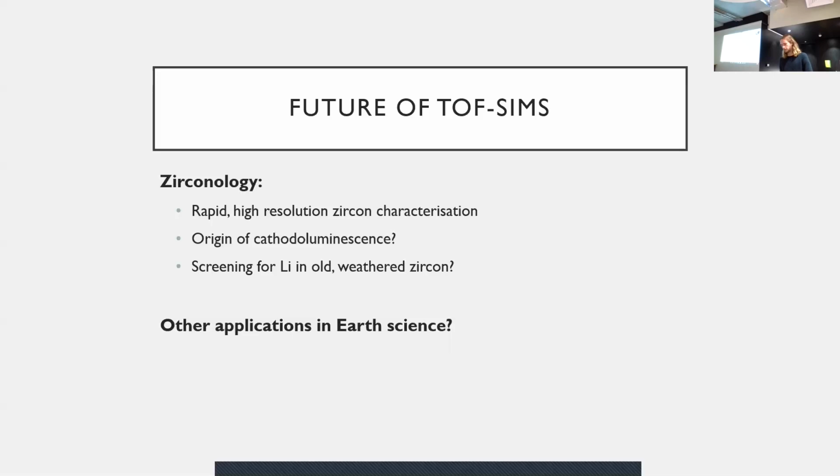Depending on the reference material, there's some variation in cost of each one. But 91500 is what every uranium-lead laser lab uses as their primary reference material. The issue with that is that one day it will run out, because it's just one big crystal that they found, smashing little bits off it.